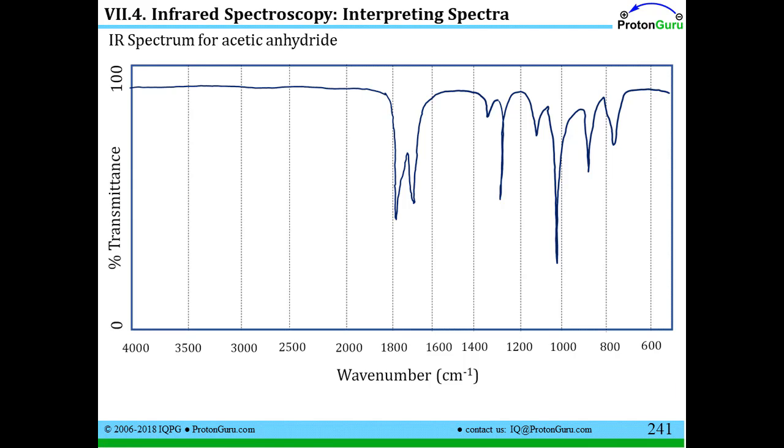And again, if we look at this spectrum, we see two pretty strong peaks, both in the area we'd expect for a CO double bond. Remember, they can come all the way up to 1850 on the chart. And if we see two of them, we might think that they're either two different functional groups in the same molecule, or if we're assuming only one functional group per molecule, pretty simple cases for our introduction, maybe it's an acid anhydride.